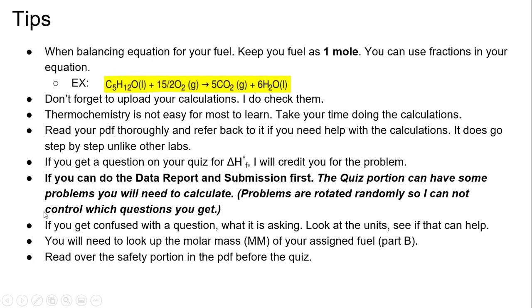You're going to need to look up the molar mass of your fuel. They're very interesting names for some of them. I'm familiar with them. I'm not sure you guys would be, but you'd have to look them up. And here's a hint for the quiz portion. Read over the safety. Make sure you understand it. And honestly, this is a PDF you probably should be printing out, because it'll make it way easier to go through this lab if you're lucky enough to do that. I didn't always have a printer, so I couldn't do things like that.